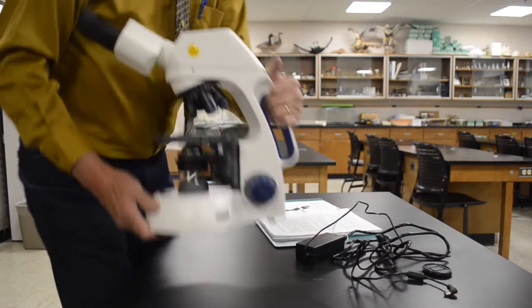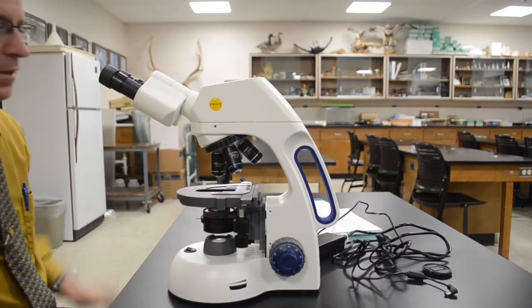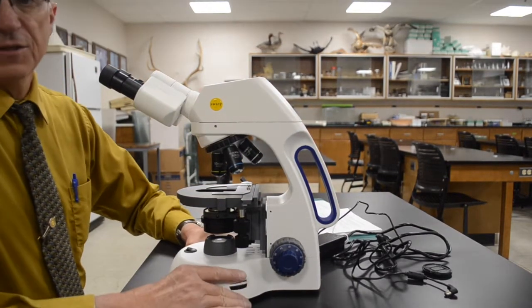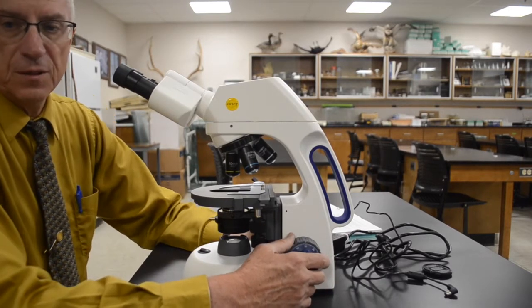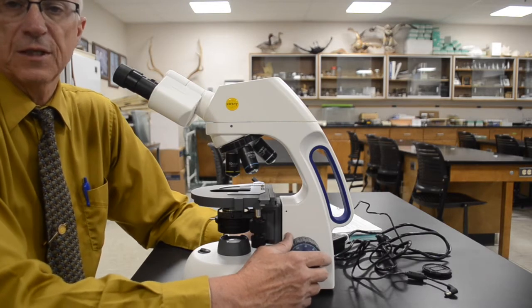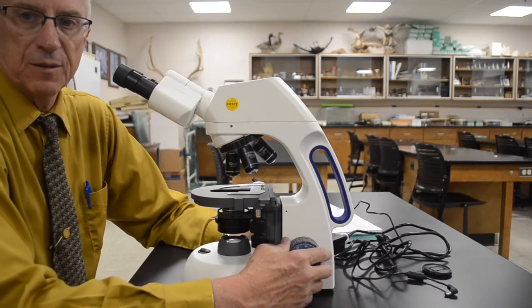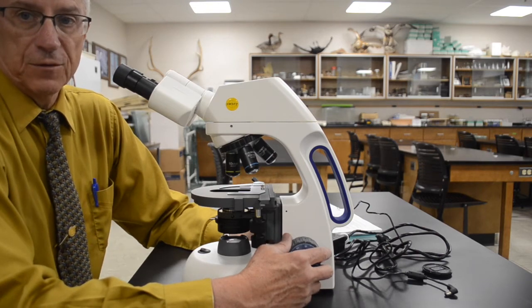By holding a microscope up there in front of your chest, it takes it out of the same level as chair backs, table tops, desktops, doorknobs, and things like that. You're much less likely to bang into things if you're holding it up there and cradling it in front of you like a baby.